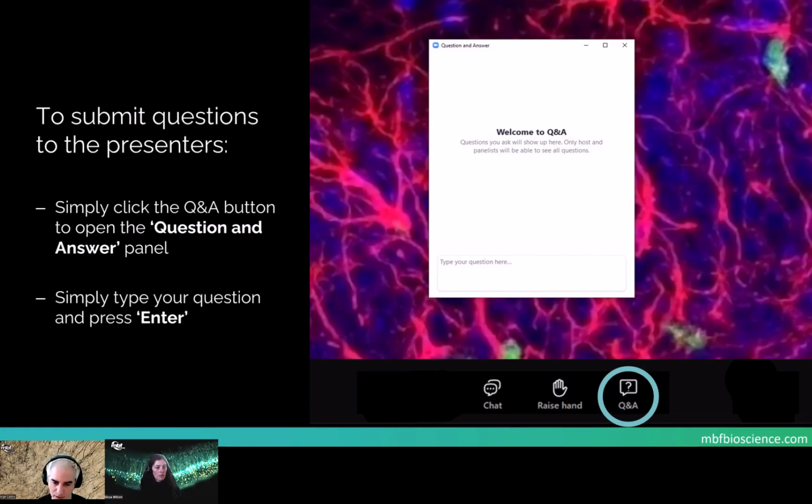There is a question about doing the detection on two different populations, like NeuN, for example, and IBA1. Yes, we can handle multiple markers and multiple populations. You will need to do it in multiple runs, one with the classifier for NeuN, and then the other for IBA1. But you can put it in a queue and run the first one and then another. So that's perfectly doable.